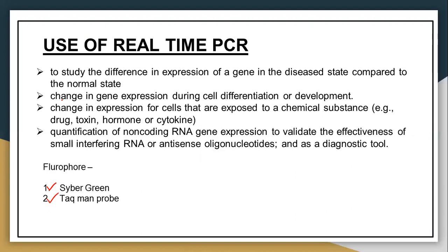We'll see that later. In the case of SYBR Green, it binds to double-stranded DNA, so more double-stranded DNA means more fluorescence. More amplification means a higher level of fluorescence. This is how SYBR Green and TaqMan, these two fluorophore probes, are used.